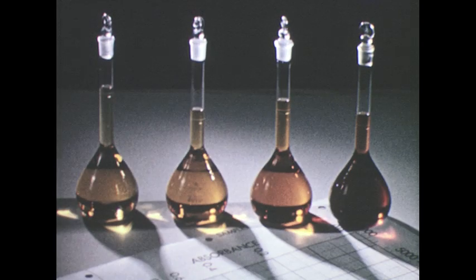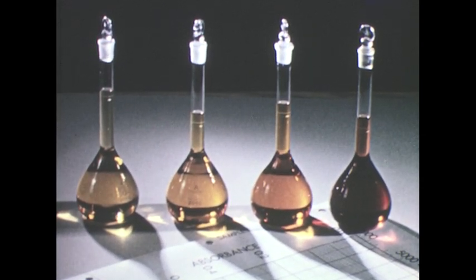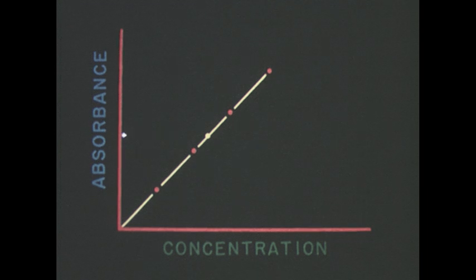By measuring the absorbances of solutions of known concentrations at constant wavelengths, a calibration graph can be prepared. An unknown sample can then be analyzed by measuring the absorbance at the same wavelength.